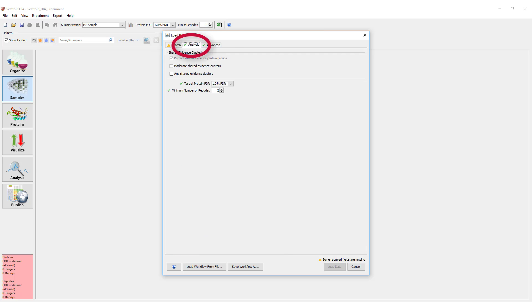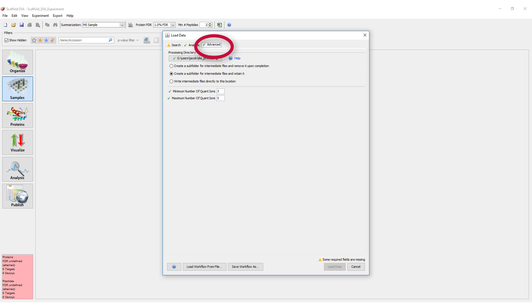Additionally, files can be organized after the data is loaded in Scaffold DIA, so there is no need to organize files into bio-samples and categories during loading.